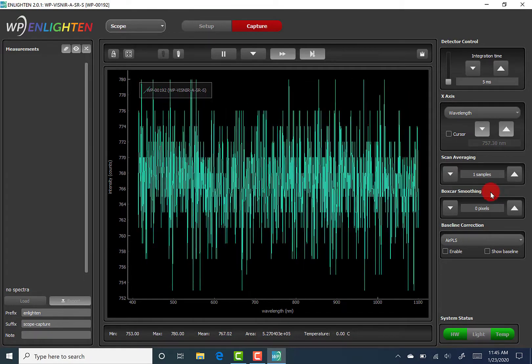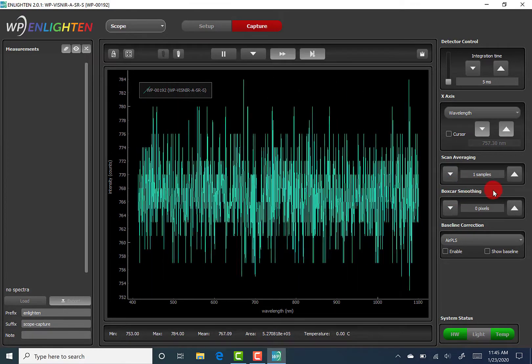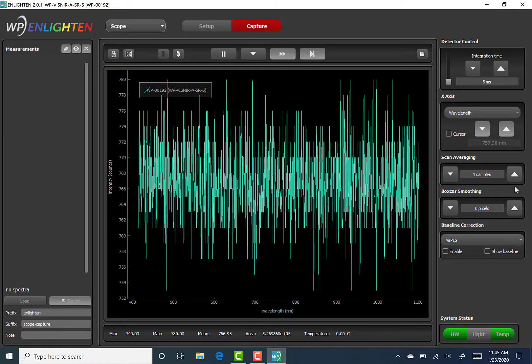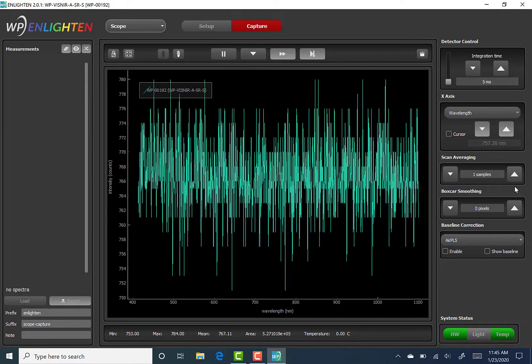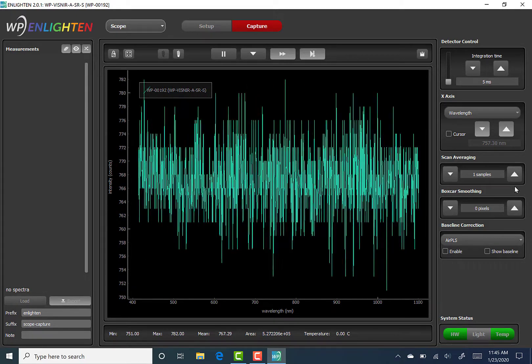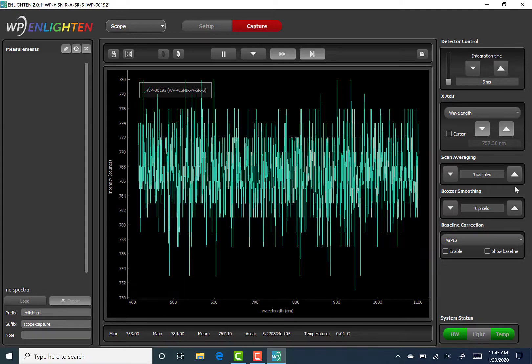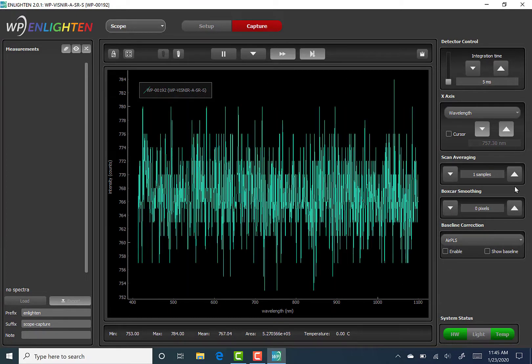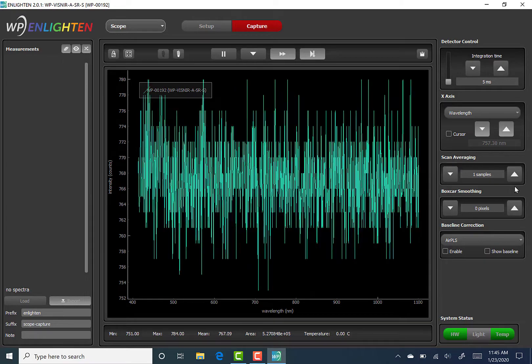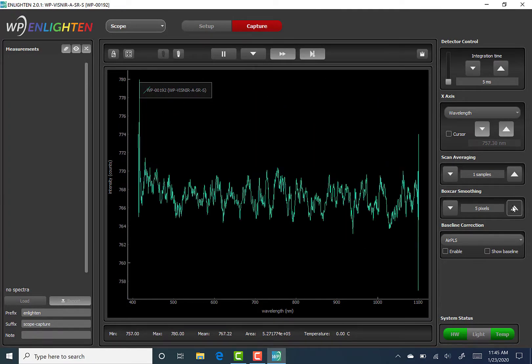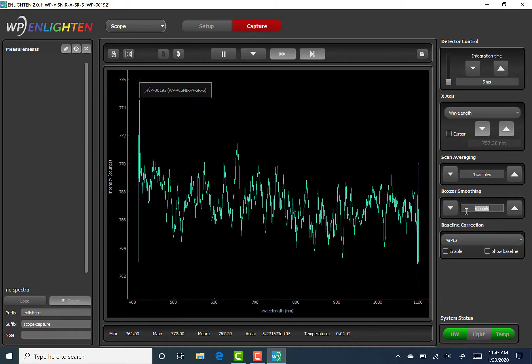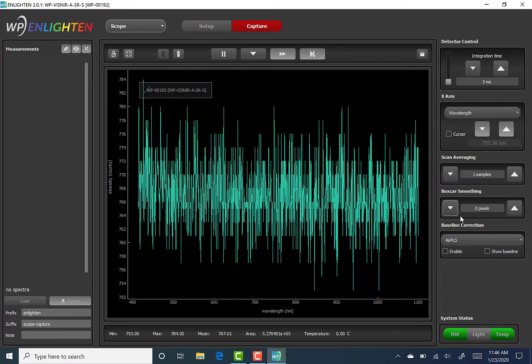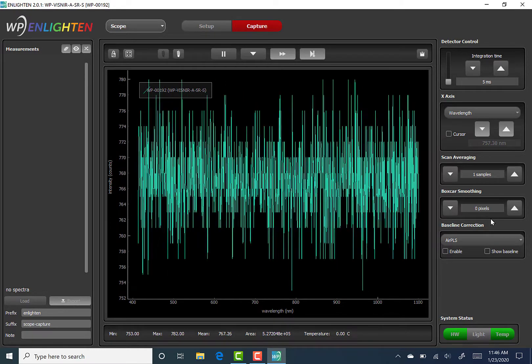Boxcar smoothing is another data processing function that can be applied to measurements. Boxcar smoothing is an alternative to scan averaging if the user cannot afford to add extra time to their experiments. This technique slides a moving average across the spectrum, averaging over wavelengths or space, instead of time. The user can set the number of pixels to average by using the up and down arrows or editing the numeric field directly. Keep in mind that the number of pixels must be a whole number.